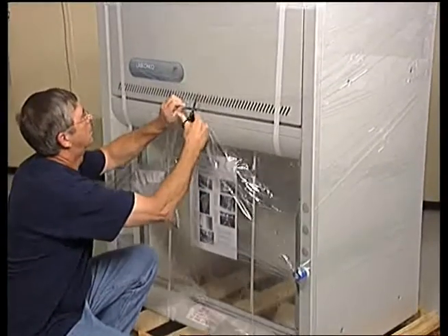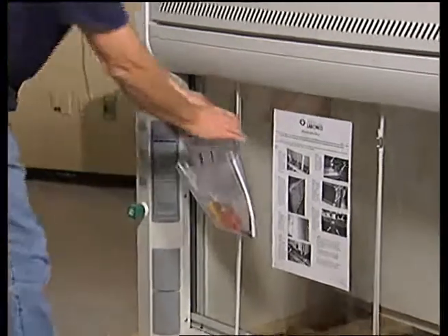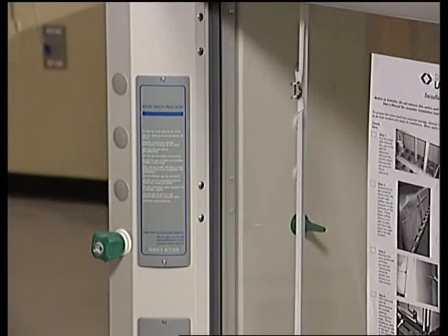Cut the shrink wrap with scissors to avoid scratching the fume hood. Remove the plastic envelope that contains your installation instruction manual and accessory hardware. Refer to the instruction manual during installation and set aside the accessory hardware for future use.